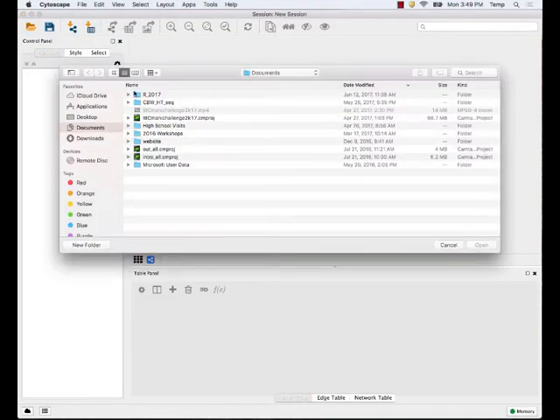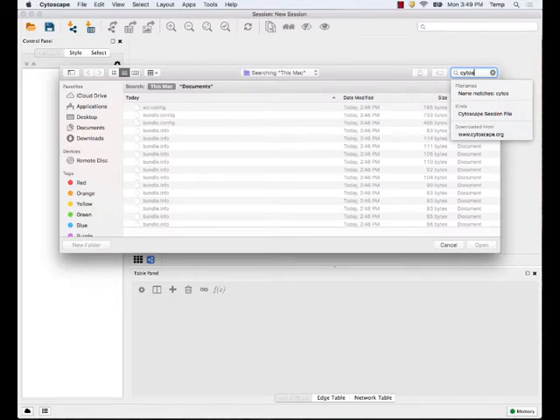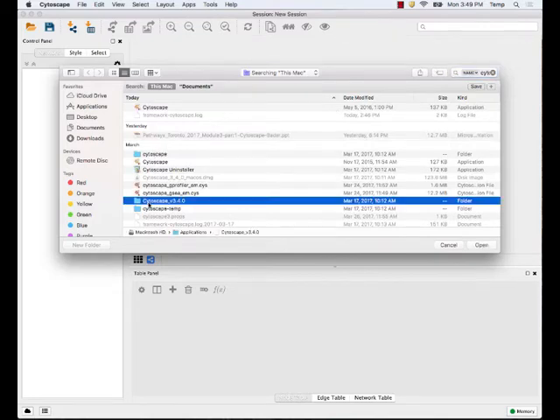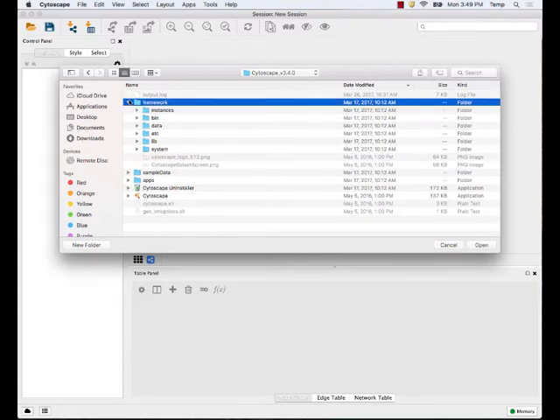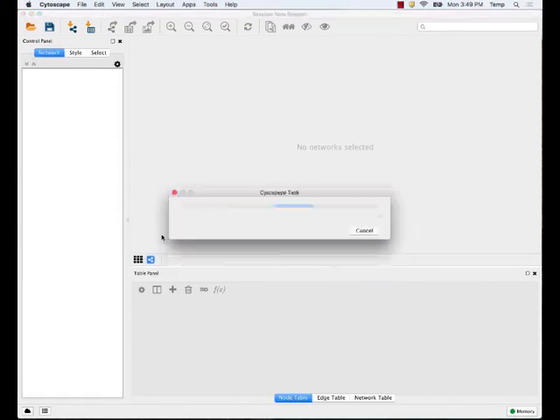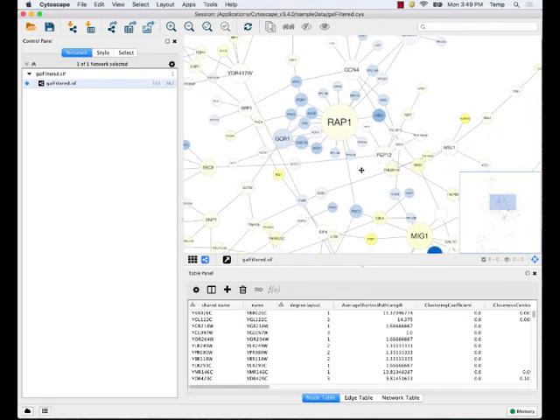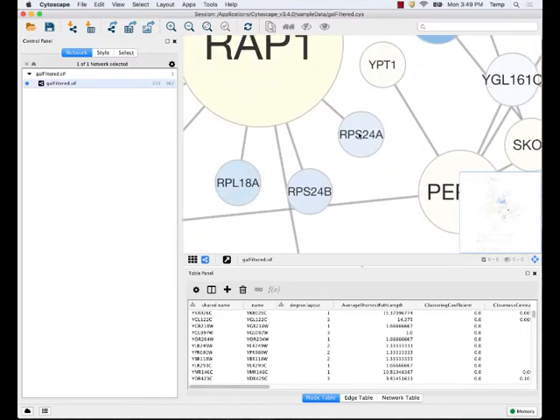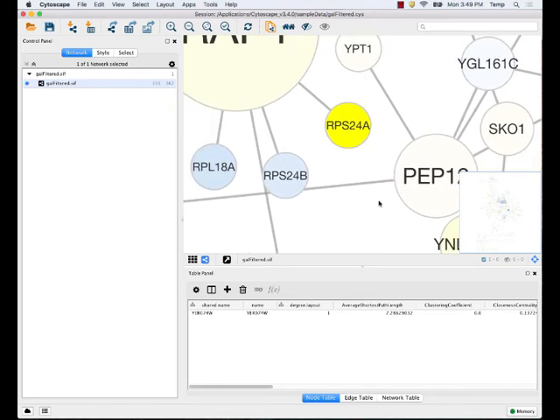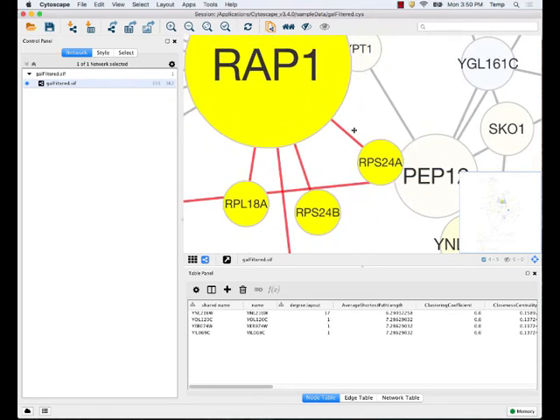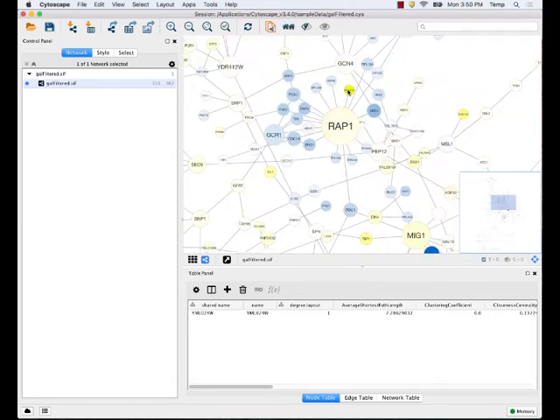I'm going to load up some sample data — a session file that comes as an example. It's a yeast network of protein interactions and protein-DNA interactions. Cytoscape allows you to browse around, click and move things, and select different elements. Each of these circles is a node and the lines are edges.